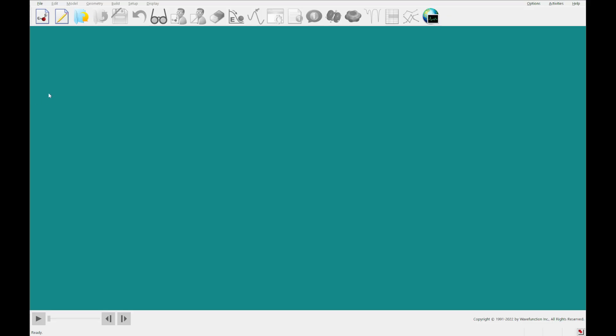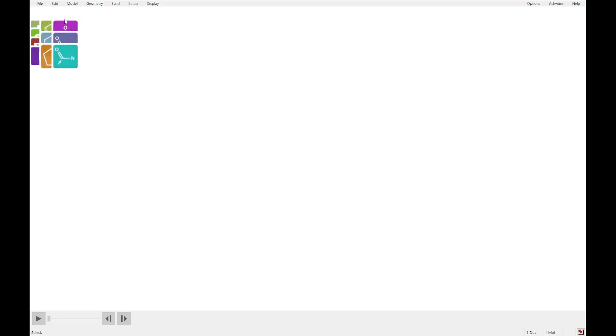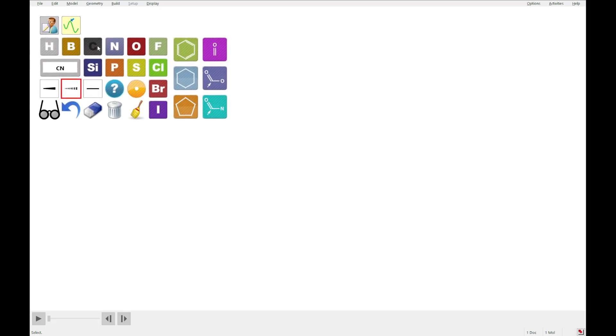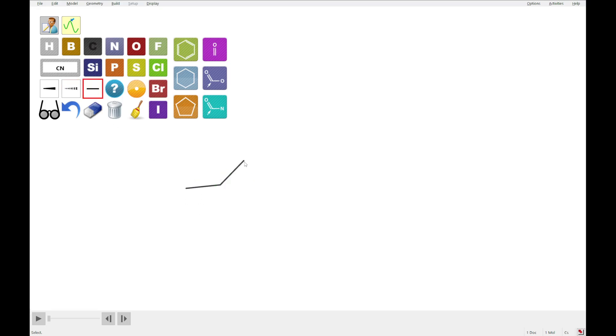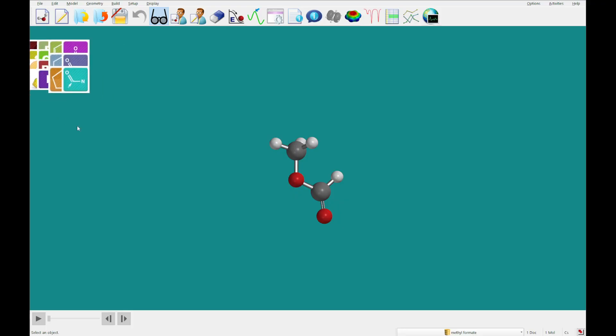Which I already have open in another window, so without further ado, we are going to get started by building methyl formate, which I'm going to do like this.